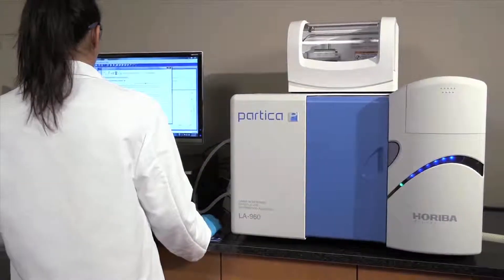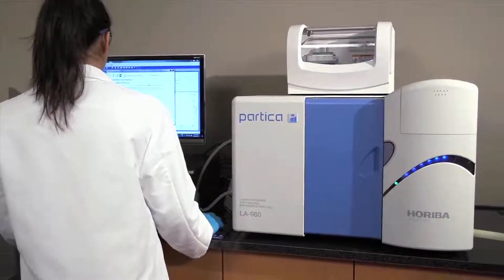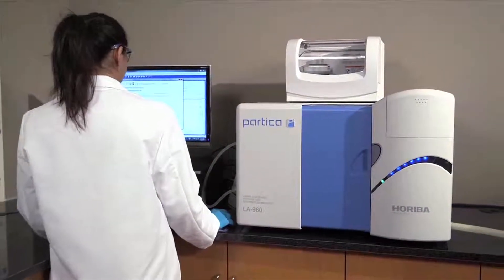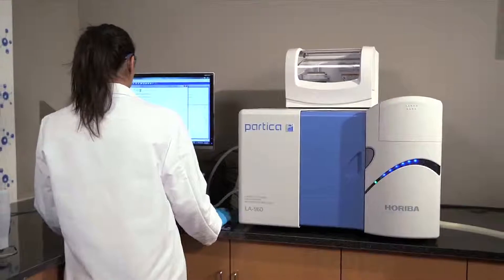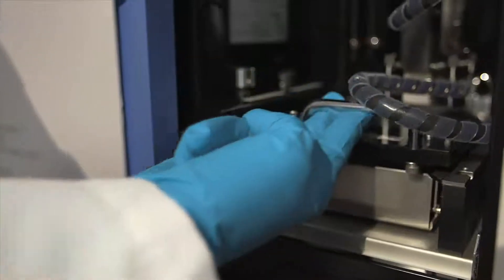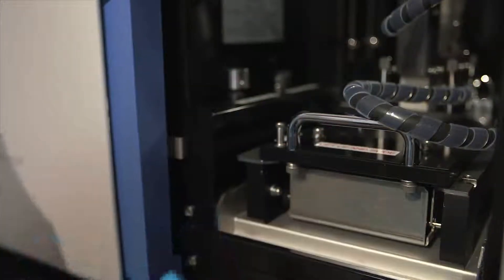Horiba introduces the LA960 laser particle size analyzer, the 10th and most advanced entry in the accomplished LA series.